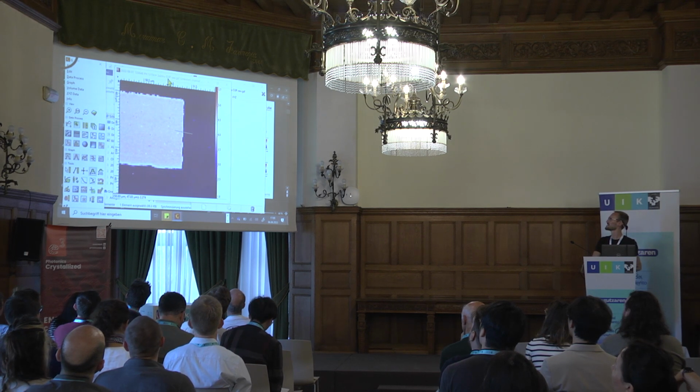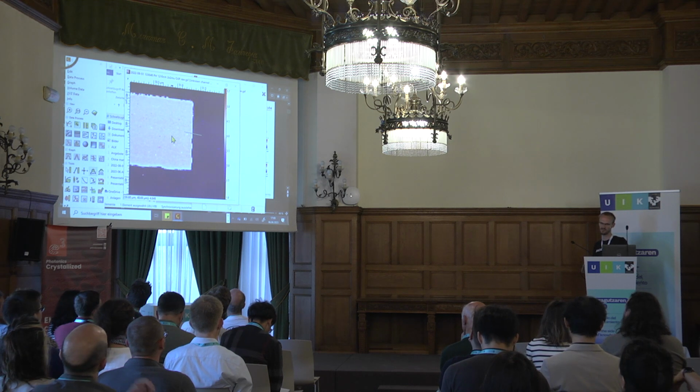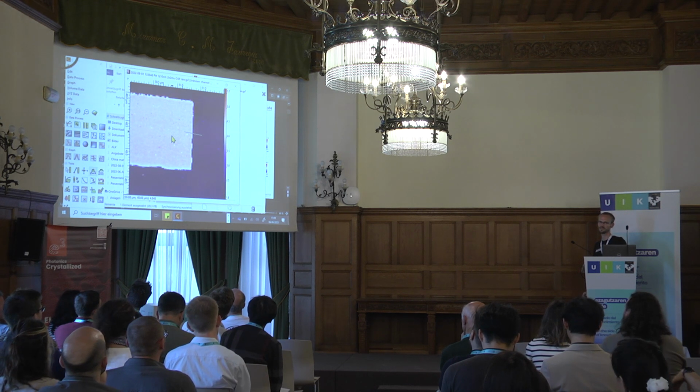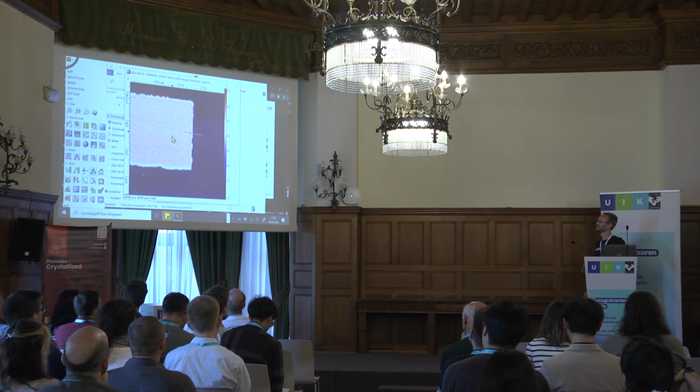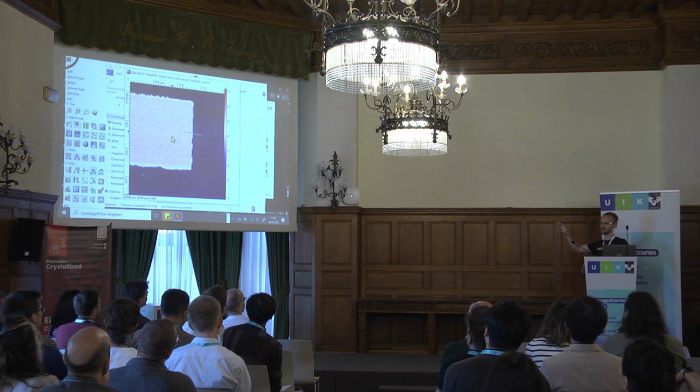This now shows why I like to use Gwyddion, because this was very easy and everybody can do it. The reason why Martin doesn't want to do it is that it's a bit dangerous, because this will remove every 2 pi jump. Here we were lucky, there was only one jump, so it's very easy to correct.